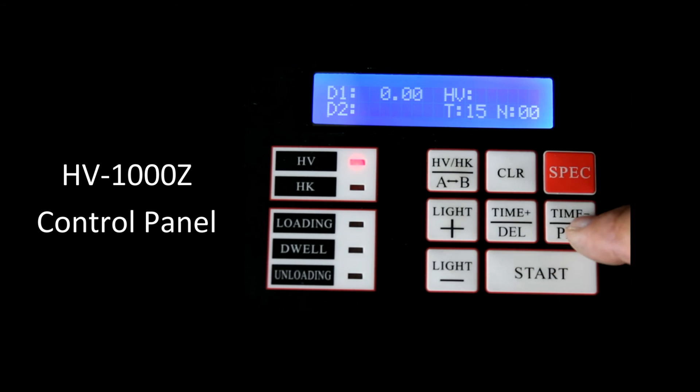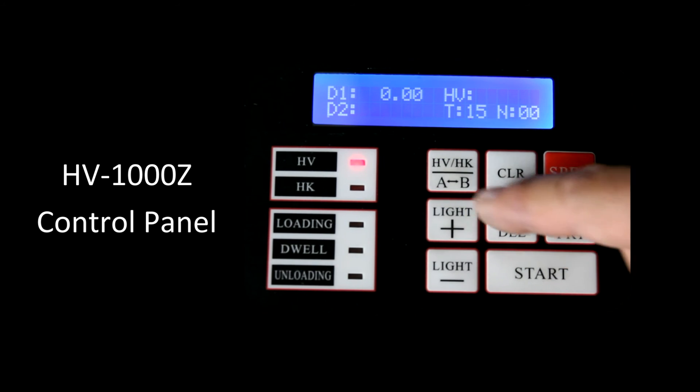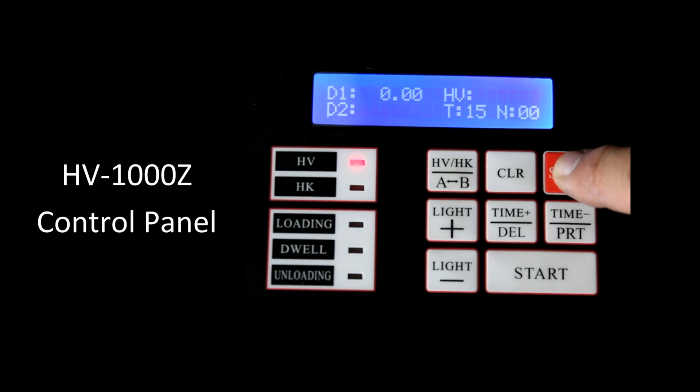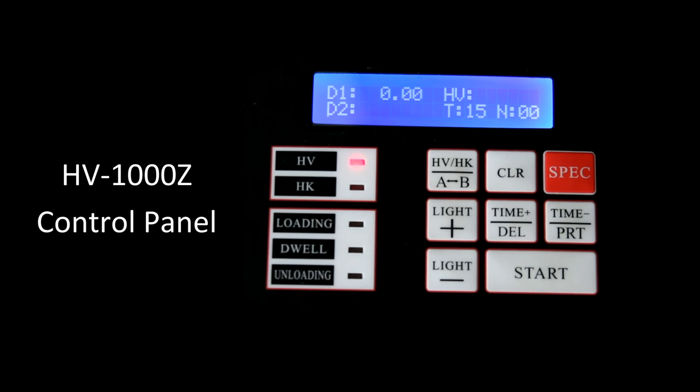A few of these buttons have a line through them. In order to access what's below the line, we have to hit spec first. So if we wanted to rotate the turret from A to B, we press spec then A to B — that rotates to the indenter. Do it again and it rotates to the 10x objective, and likewise back to the indenter and to the 40x objective. If we want to print, since it's below the line, we hit spec and then print following our measurements.